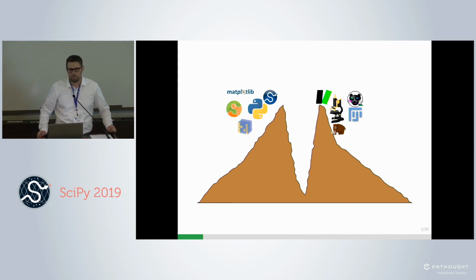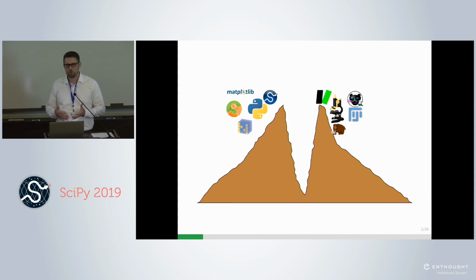And then there's BigDataViewer, which unfortunately does not have a logo, but this is my favorite tool in this whole environment. It's a visualization tool for arbitrarily large volumetric data, that reslices cross sections through volumetric data at arbitrary orientations and zoom levels.